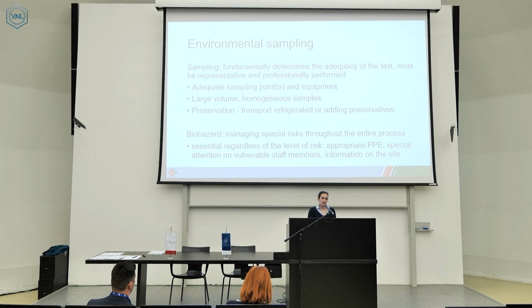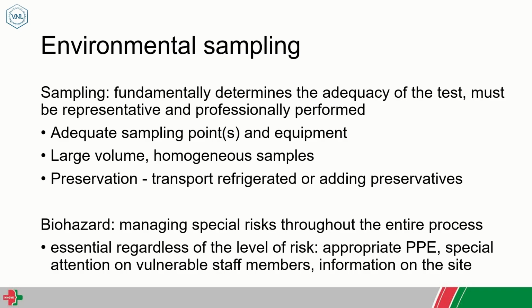And usually these samples are of large volume, even up to several liters. And preservation also may be needed; in terms of microbial samples, maybe just refrigeration, but also preservation can be necessary. And if there is a biohazard risk, the sampling staff should manage these special risks throughout the entire process.